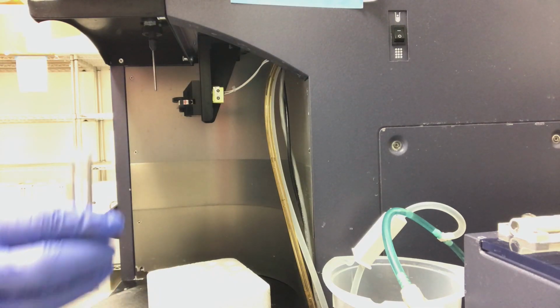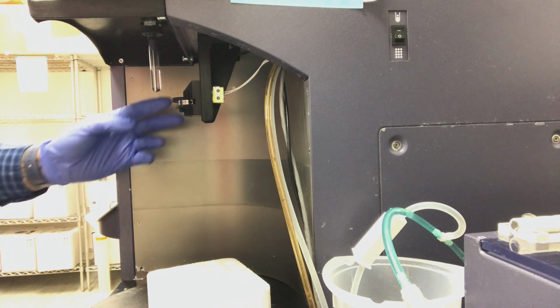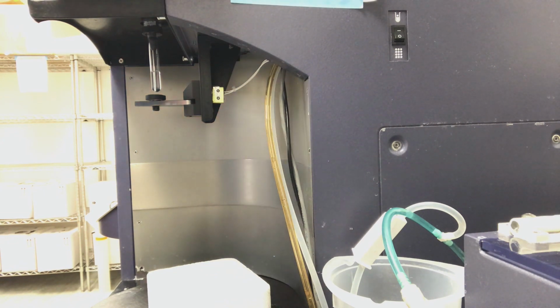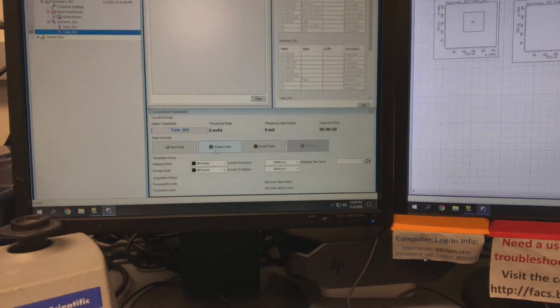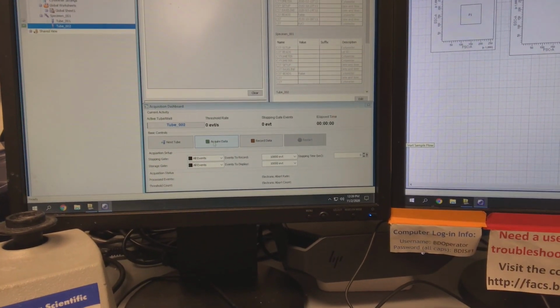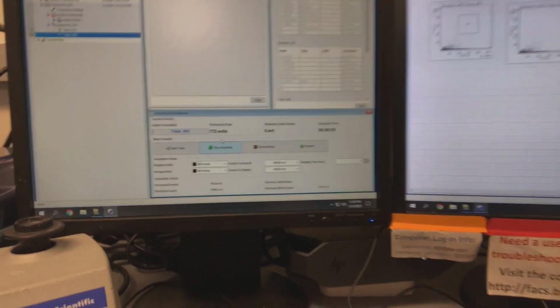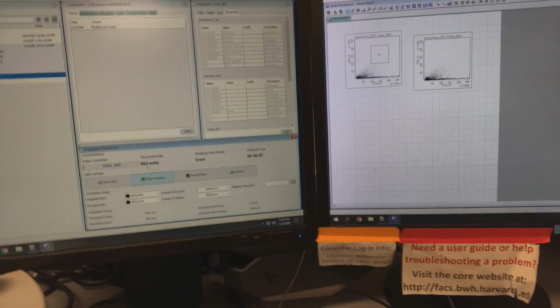So now we take our tube of sample, load it onto the machine, center the arm. Now, as I said, the machine is always in run, so as of right now, you want to work quickly. Come to the acquisition dashboard, begin acquiring your data. That is some dirty water. As you can see, there's a high threshold rate.